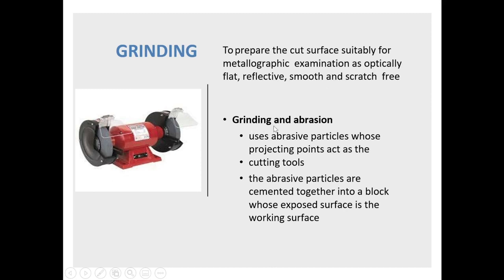So in grinding, use abrasive particles whose projecting points act as the cutting tools. So in this wheel there are abrasive particles which are bonded together, and that particles will act as a cutting tools. The abrasive particles are cemented together into a block whose exposed surface is a working surface. So this exposed surface is a working surface.